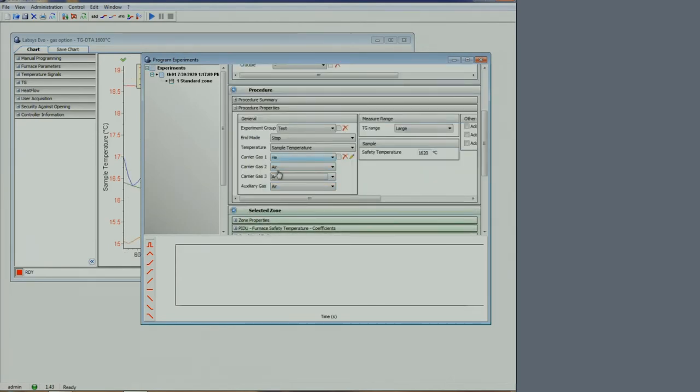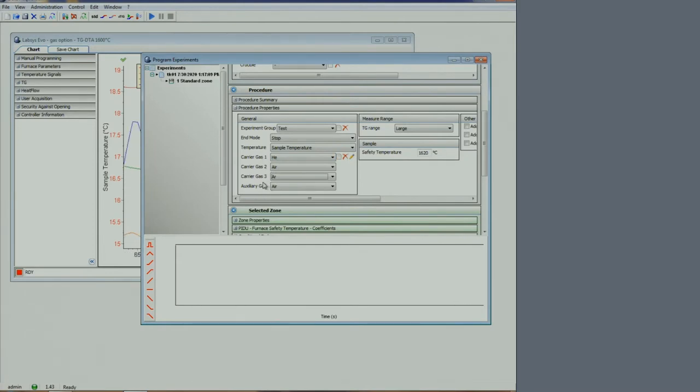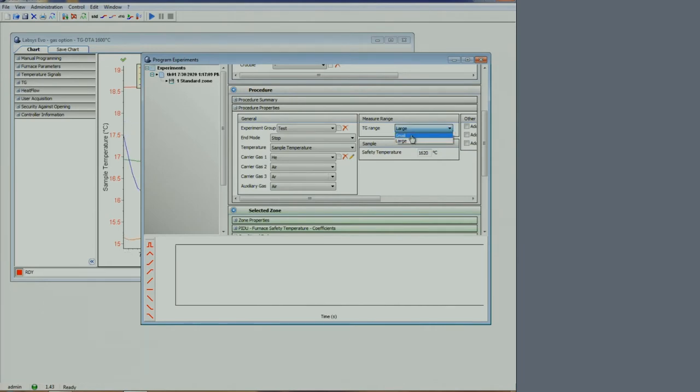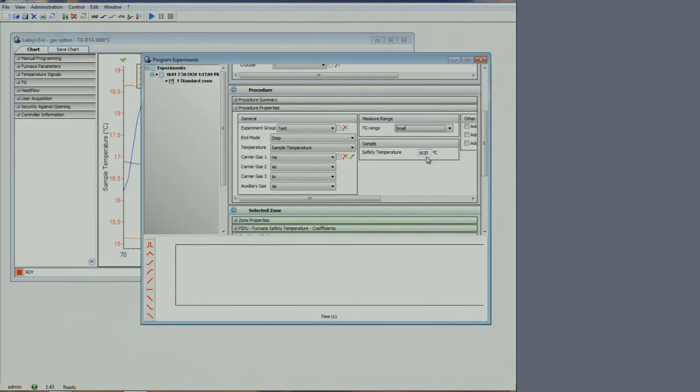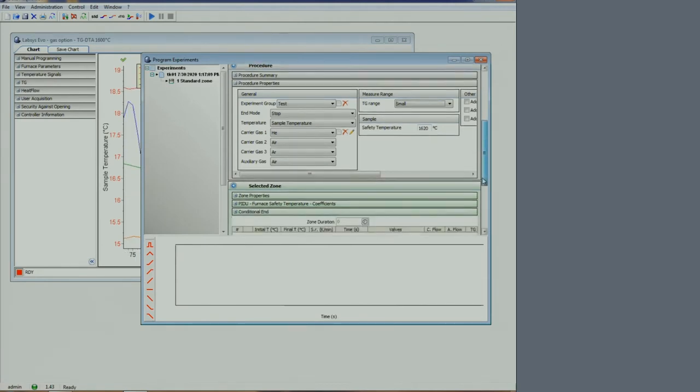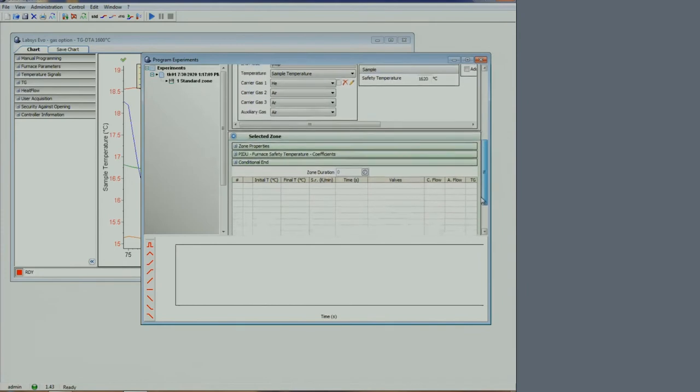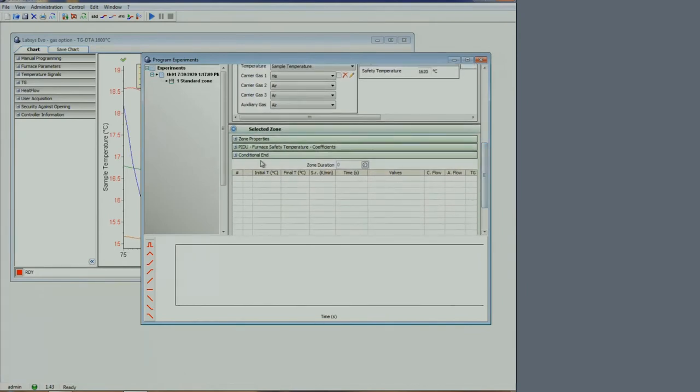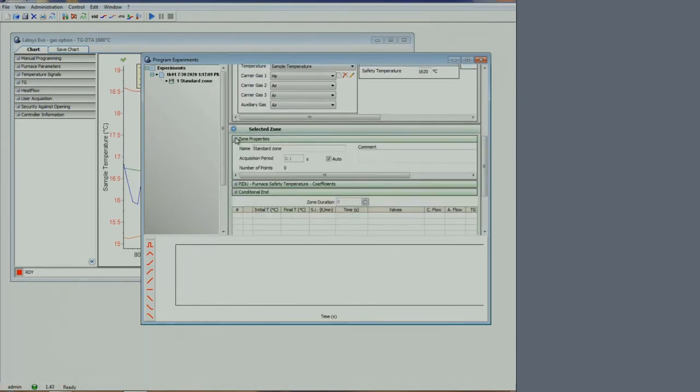In the procedure section, you will see the gas is listed as gas 1, 2, and 3. TG range can be large or small depending on the weight loss expected for your sample. The safety temperature is the temperature at which the system will shut off if there is a mistake. Typically, zone property is left as is. Do not change the PIDU settings.